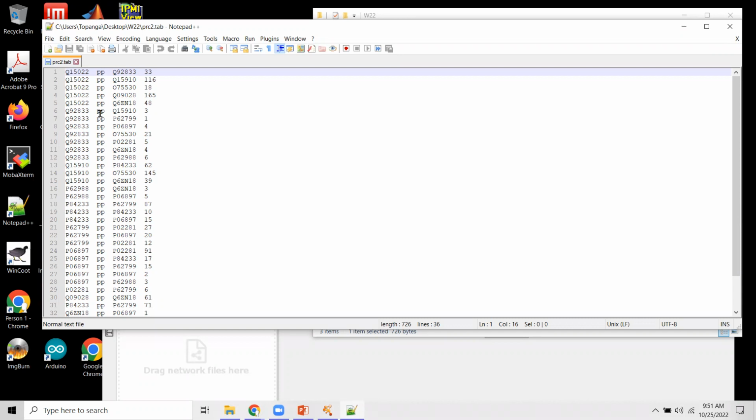Those are conventional ways Cytoscape was using initially. Different data sources might use different interaction types with different meanings, which creates problems when trying to merge data or use different apps. But I tend to use the canonical thing without putting much meaning behind the type besides the type of molecules interacting. The fourth column is redundant.